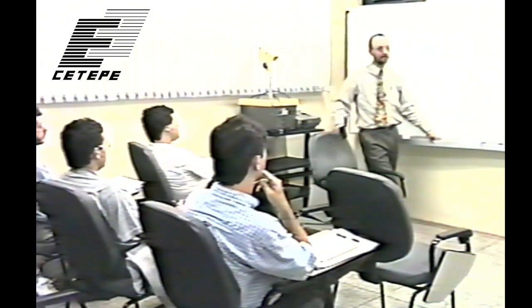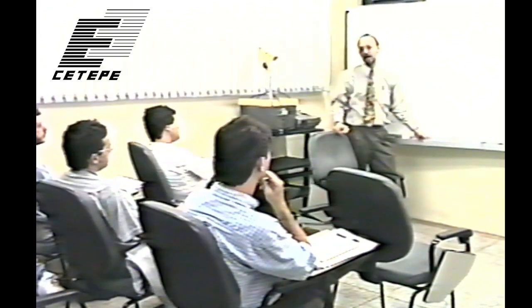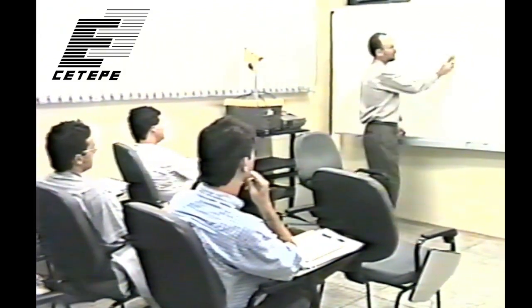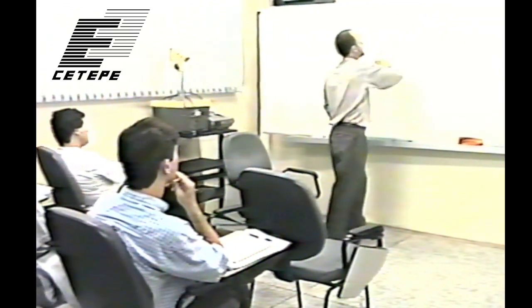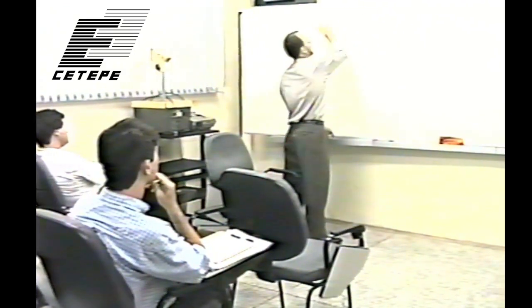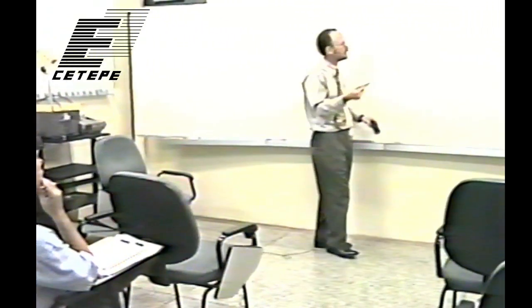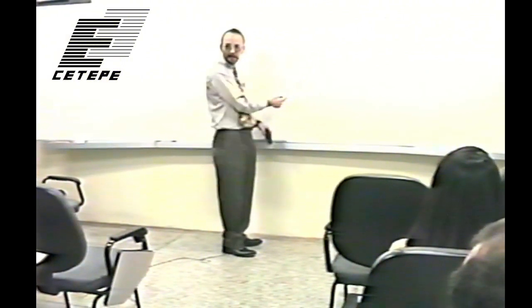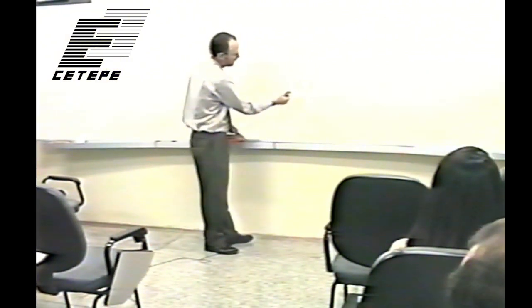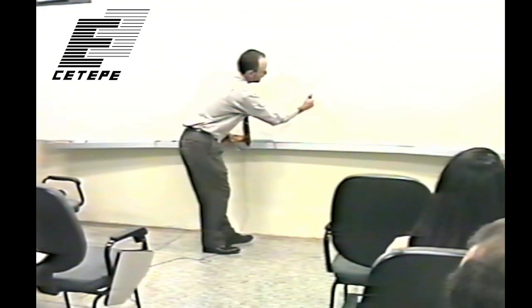crystalline scintillators. What he's talking about, there are some materials, the most popular of which is cesium iodide, which you can grow in single crystal columns. And they have a number of advantages over granular phosphors. These things here we talked about were granular phosphors, and I think I have a slide of them at some point. But basically, if you blew them up, they're little granules like this, and the diameters are usually between 5 and 15 microns.